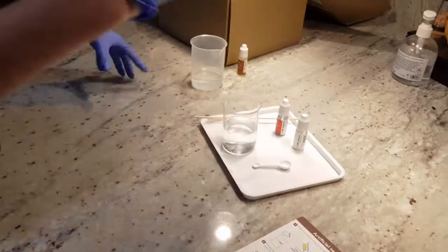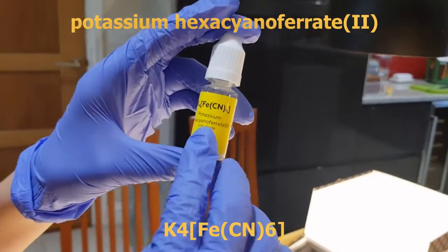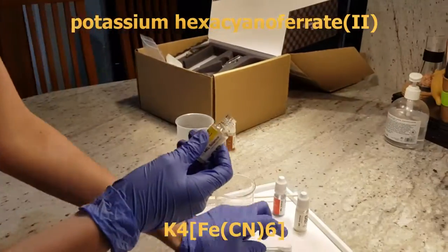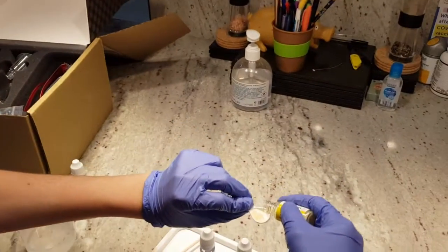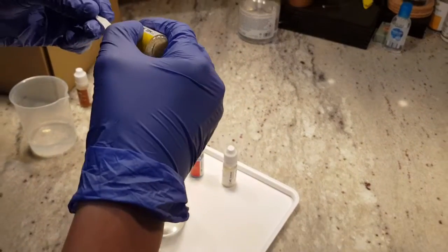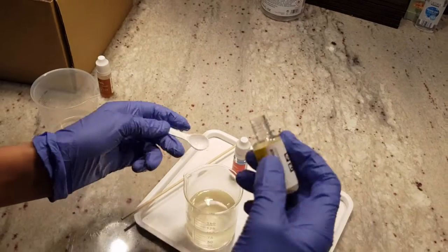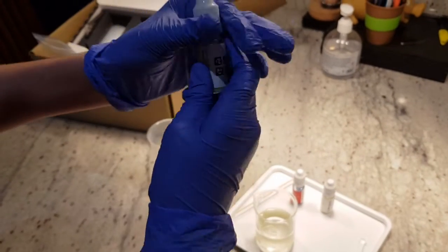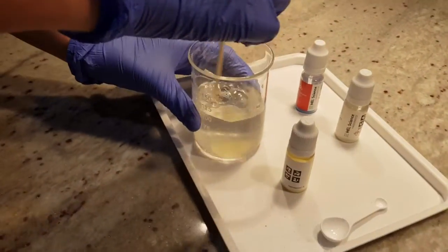Next I need to go and pour in potassium hexacyanoferrate, and I need to put in 2 big spoons of it. Over here, you don't want this going on the table. Two. After I screw this on, I just have to mix it until everything dissolves.